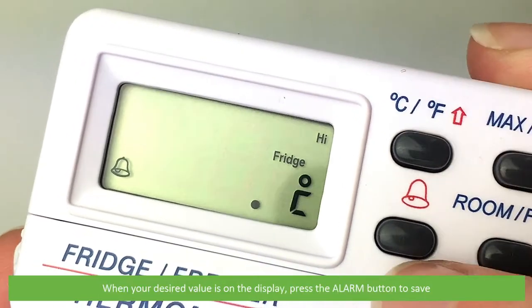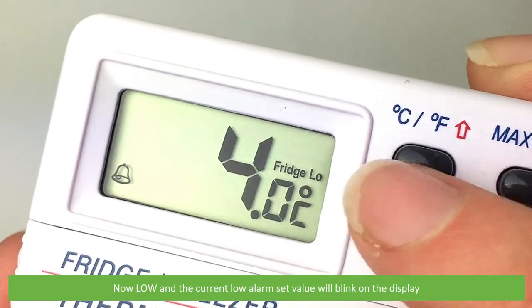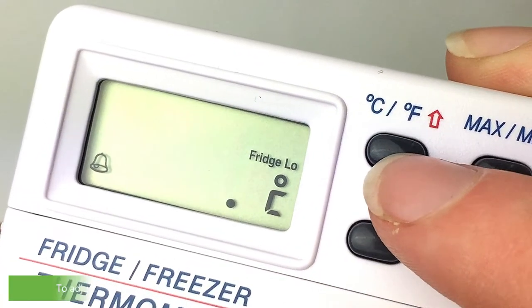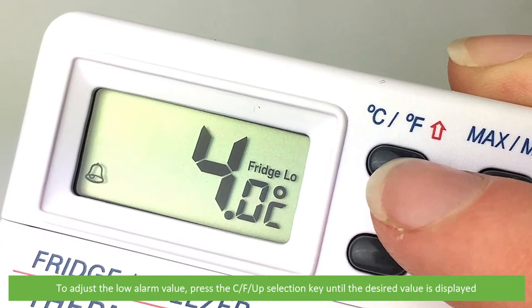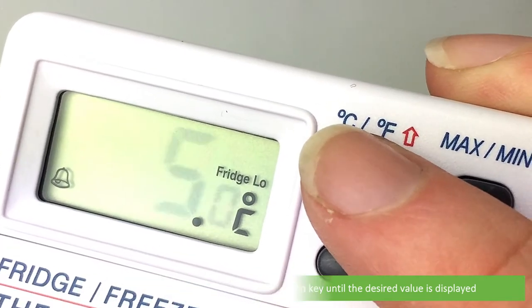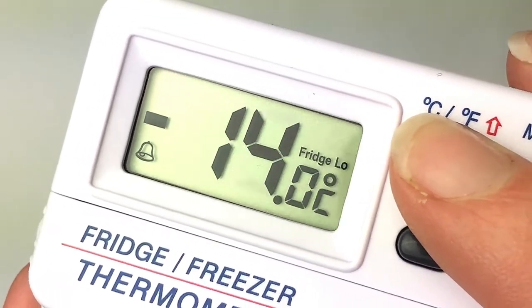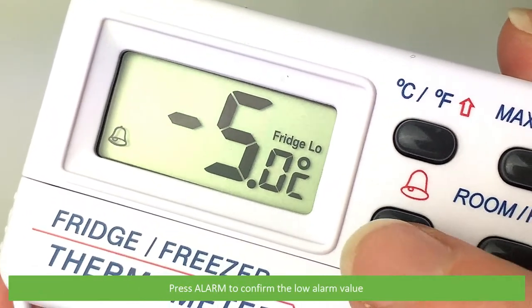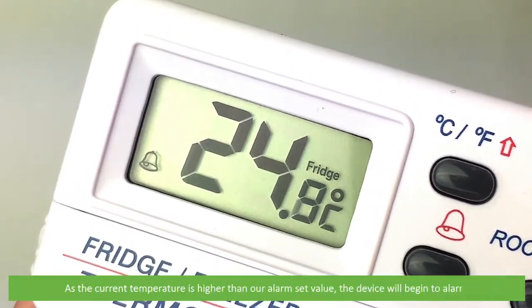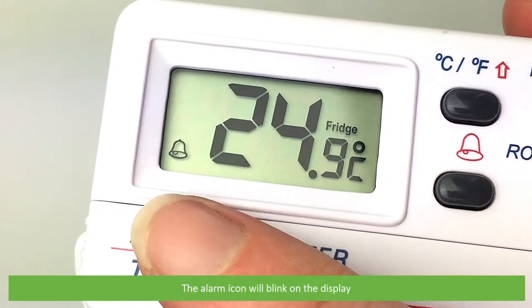When your desired value is on the display, press the alarm button to save. Now Low and the current low alarm set value will blink on the display. To adjust the low alarm value, press the Celsius/Fahrenheit up selection key until the desired value is displayed. Press alarm to confirm the low alarm value. As the current temperature is higher than our alarm set value, the device begins to alarm and the alarm icon will blink on the display.